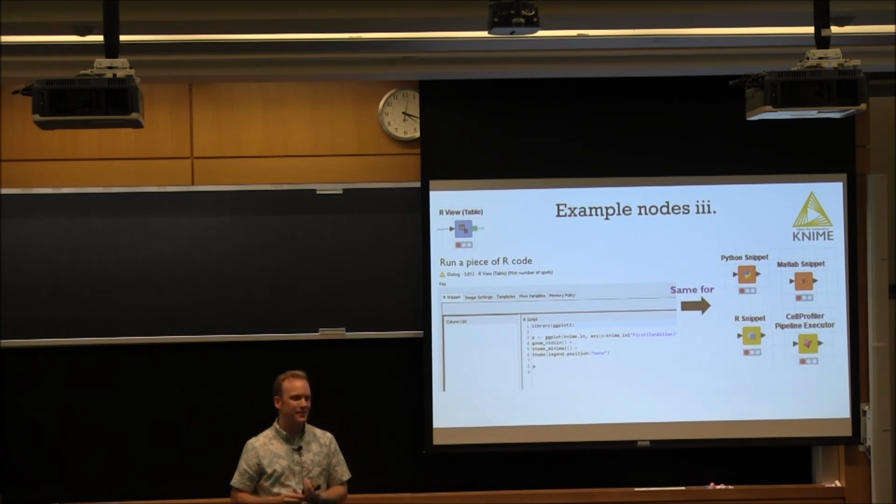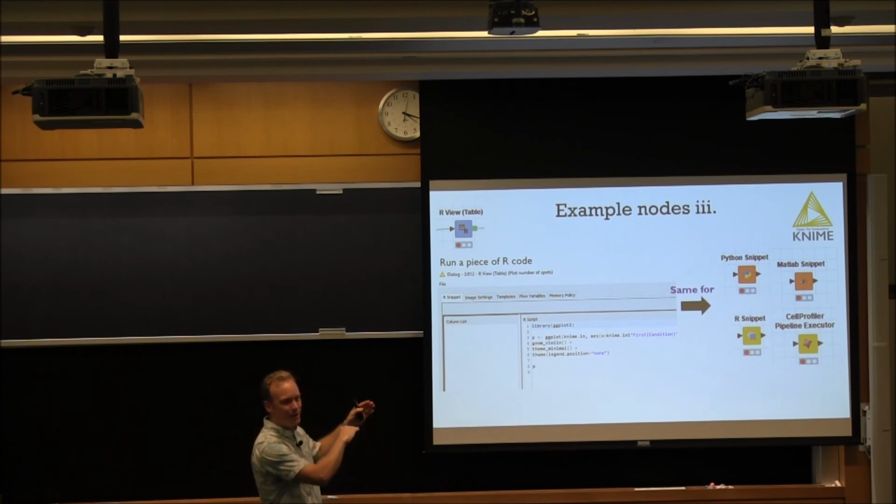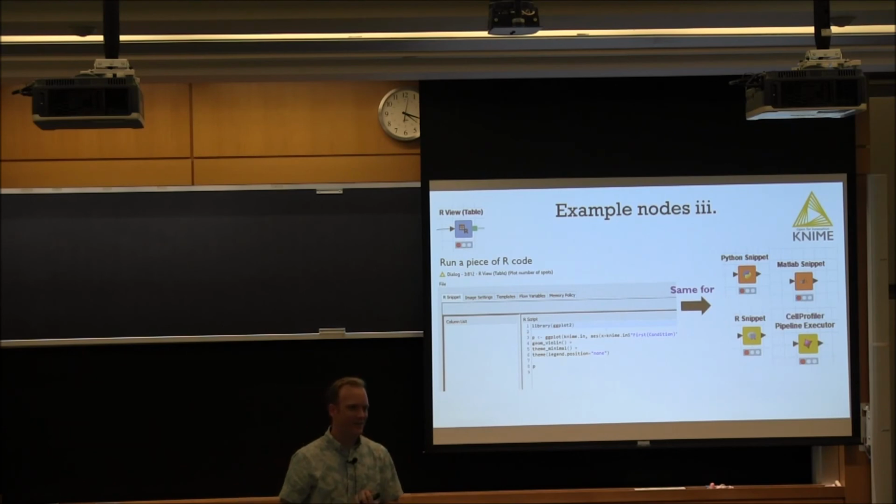Can you then plot like the MSD? Of course. Because plotting an MSD is just doing the calculation for an MSD and then plotting it. That's just an algorithm, right? It's just a calculation, so you just have a node. I should have mentioned that, but there are math nodes. Because this seems like it's just putting different things together. So are you calling MATLAB or something else?